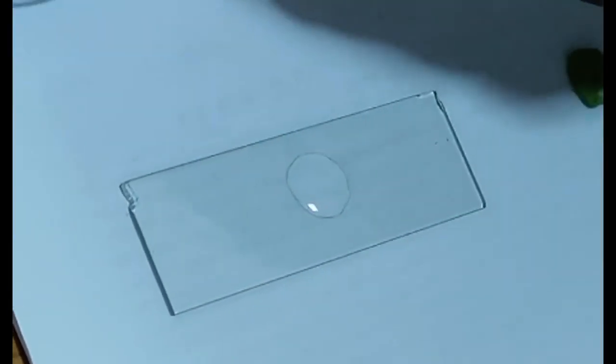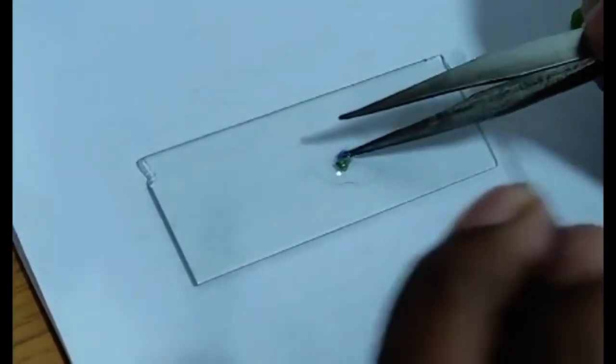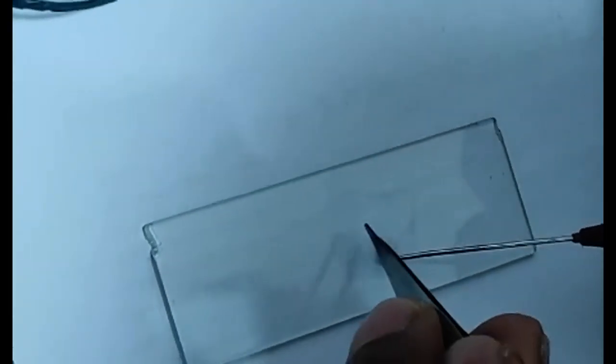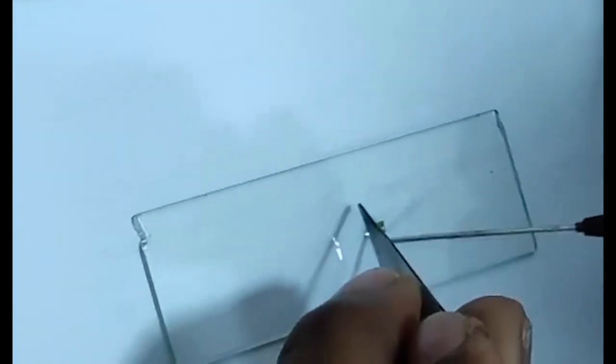Next, we have to mount the sample on a drop of water only. The extra piece of leaf we have to remove, because the trichomes are present on the surface of the epidermis.